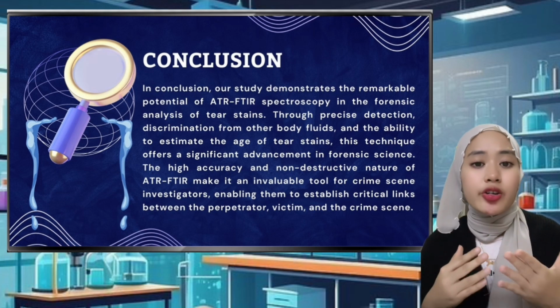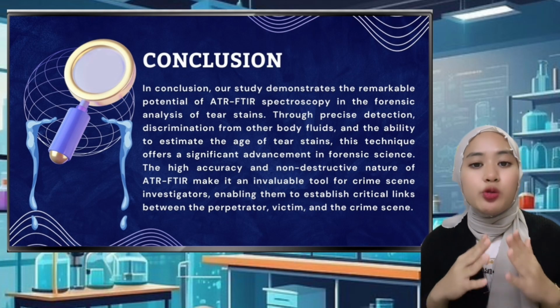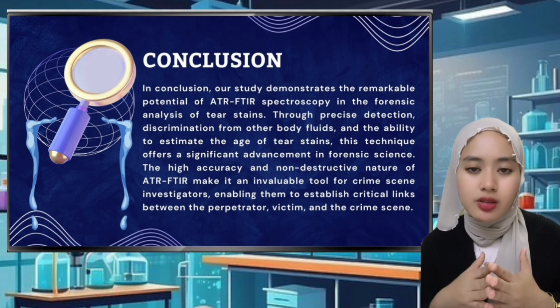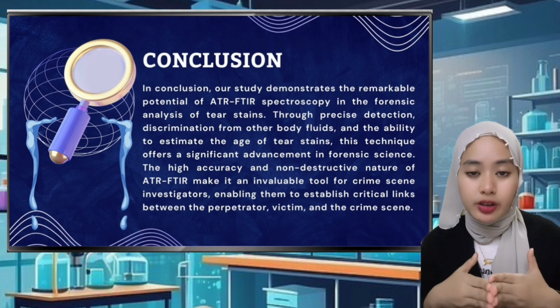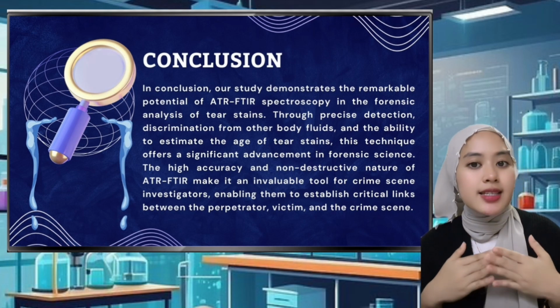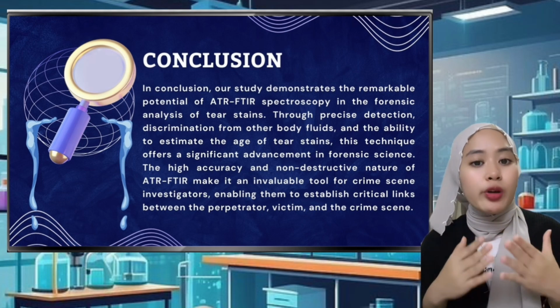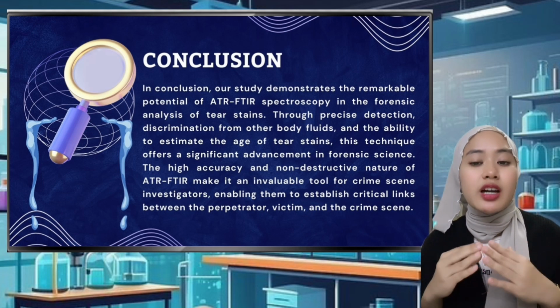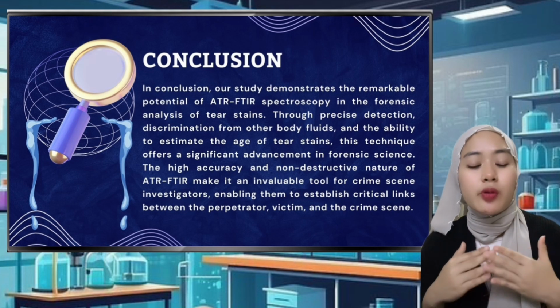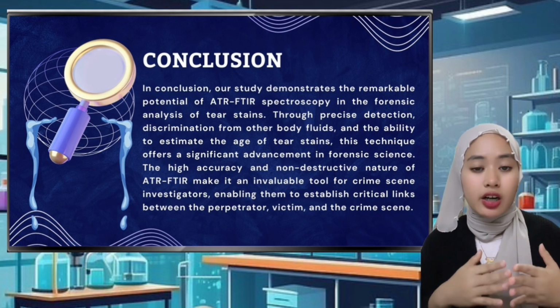Unlike blood, semen, or urine, tears have near transparent visibility, which makes the location of these stains significantly difficult. To overcome this problem, an alternative light source was used, which successfully identified the stains on porous substrates, which was further confirmed through the IR spectra. The study further investigated the potential of the tears as the age estimation marker at the crime scene.